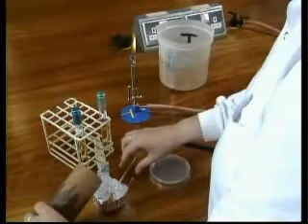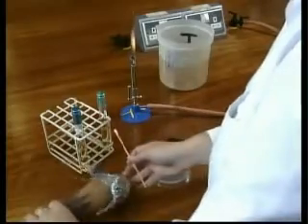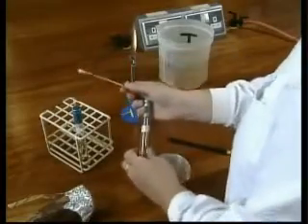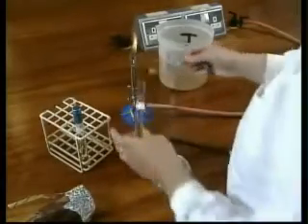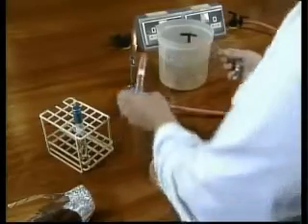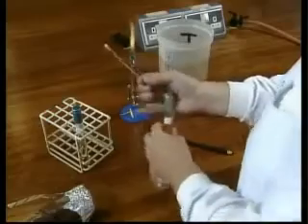The cotton bud fell onto the autoclave tinfoil lid of the container, not onto the bench, so it is still sterile and in this case can be used to inoculate the sample. If the swab touches the bench, do not use it. It will no longer be sterile.